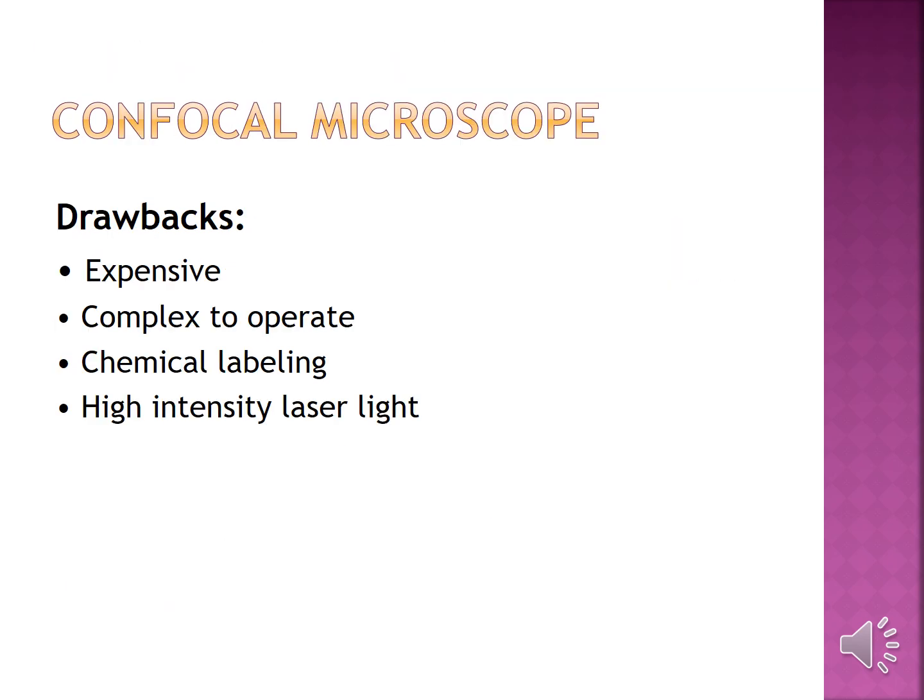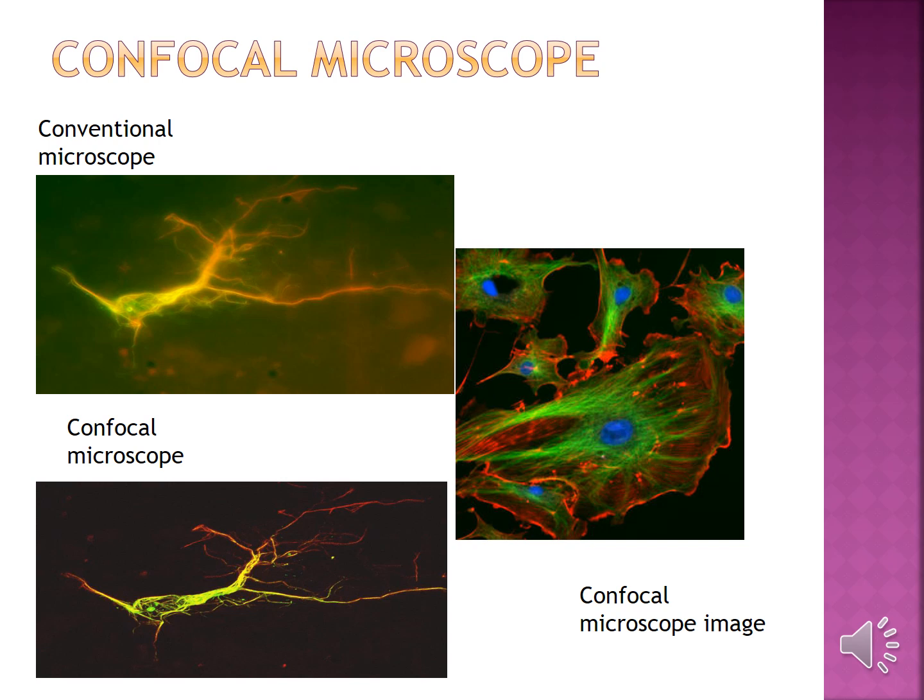The drawbacks are that it is expensive, complex to operate, and requires chemical labeling. So this is how the images are depicted using a confocal microscope.